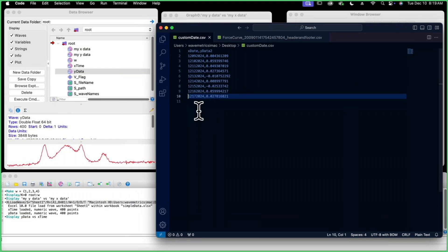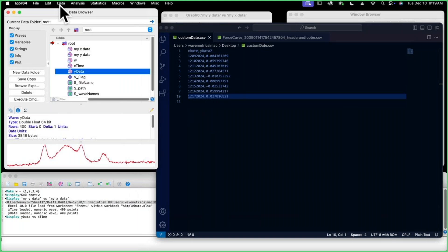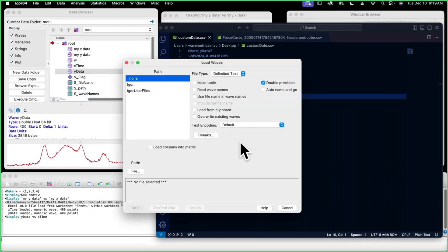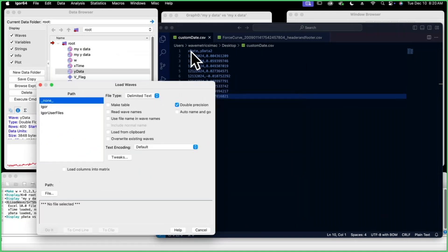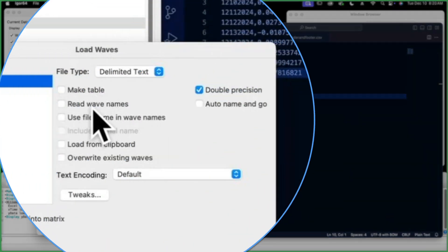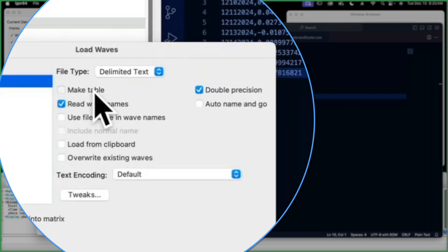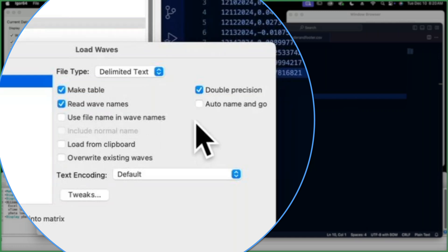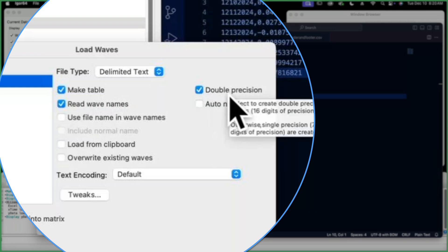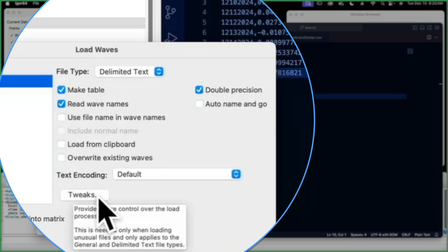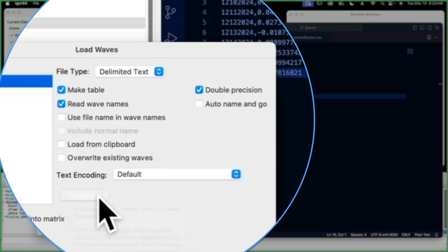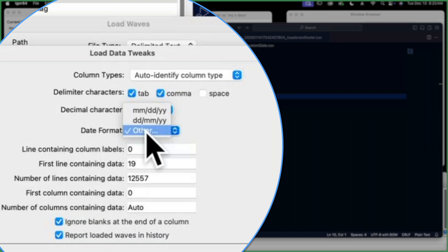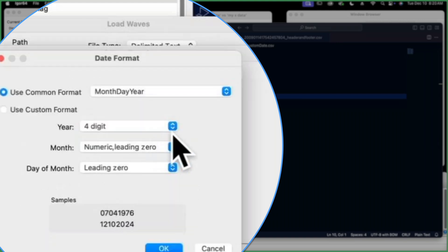So to import custom dates, we're going to go to data, load waves. We're going to go to the load waves, this first one. This is the full dialog for all types of waves. This data here does have names, so I'm going to say read wave names. I'm also going to have it make a table because when I load waves, I like to see the table right when it's imported, just to show what it's imported, what the data looks like to make sure everything imported as I expected. I'm going to keep double precision checked, and I'm going to go to this tweaks button.